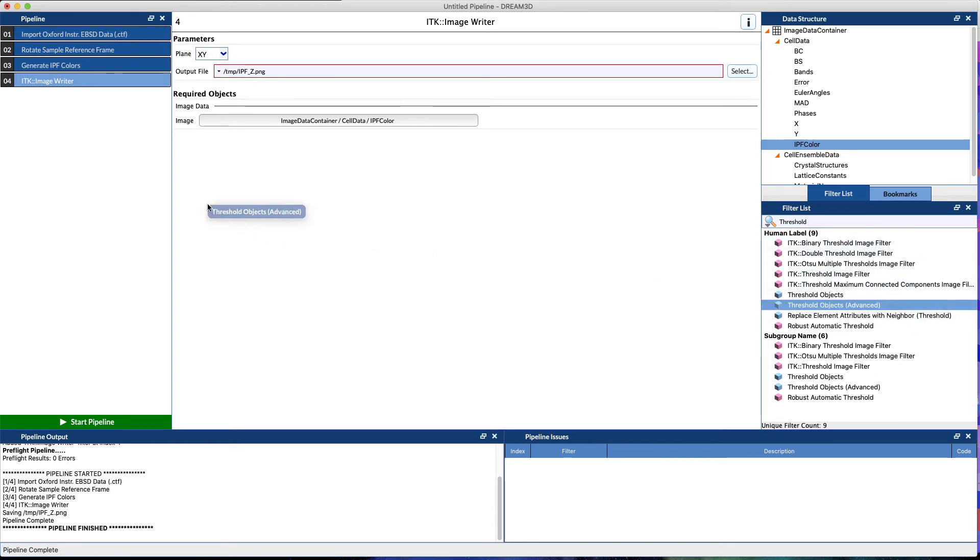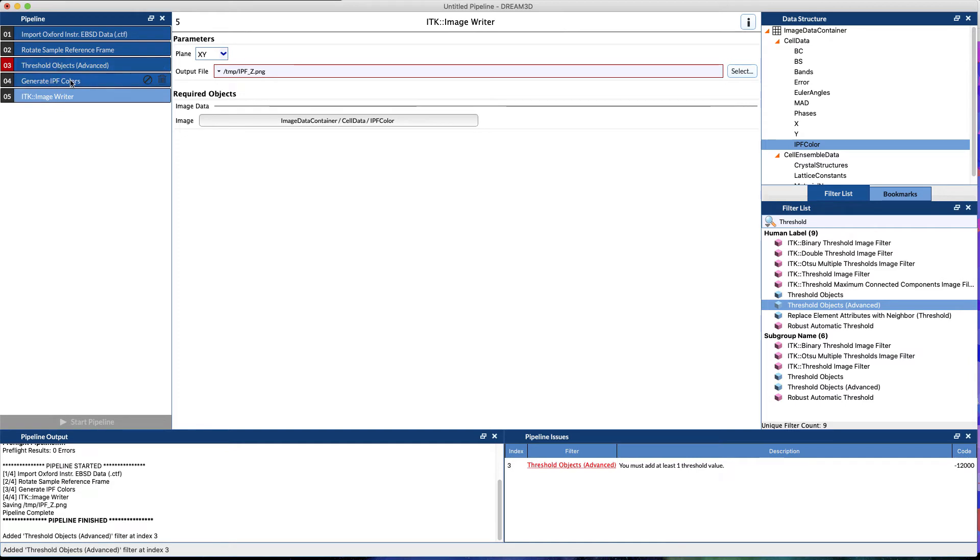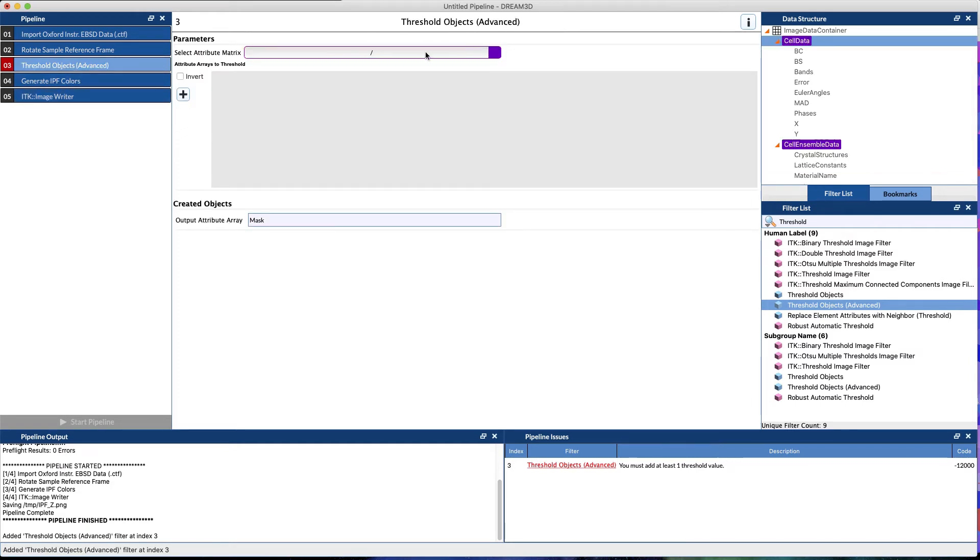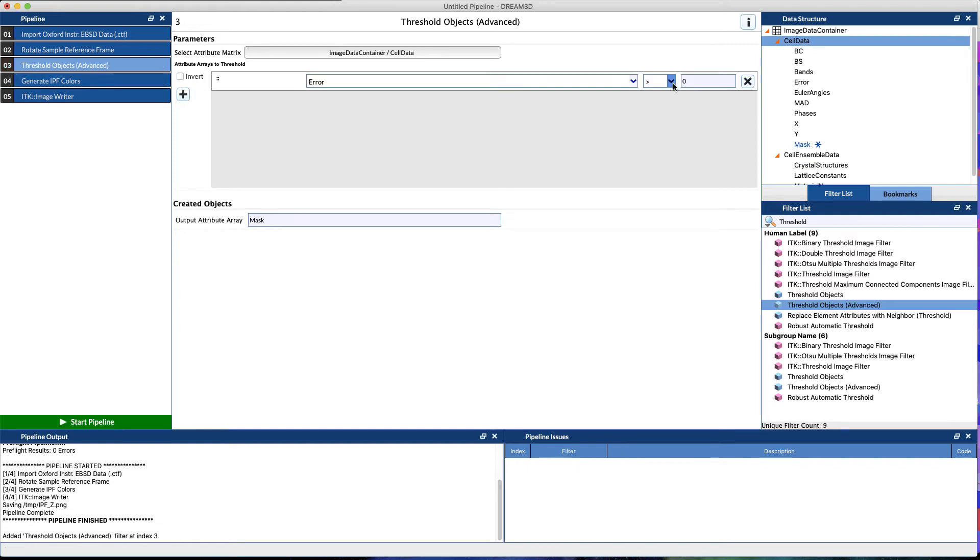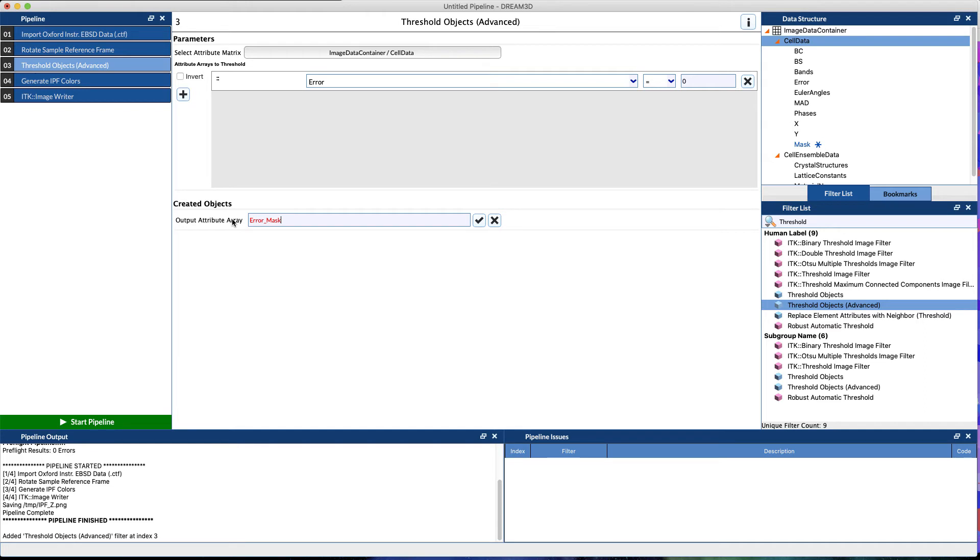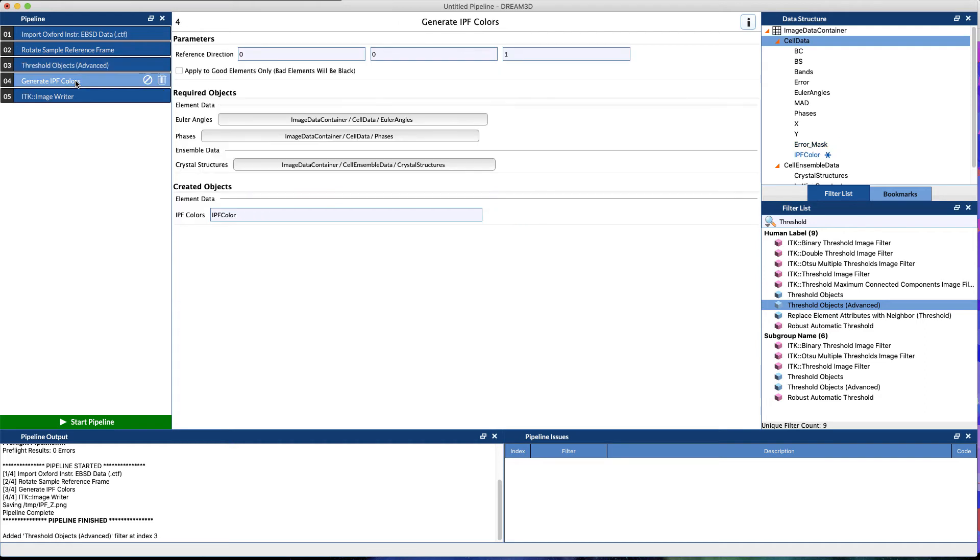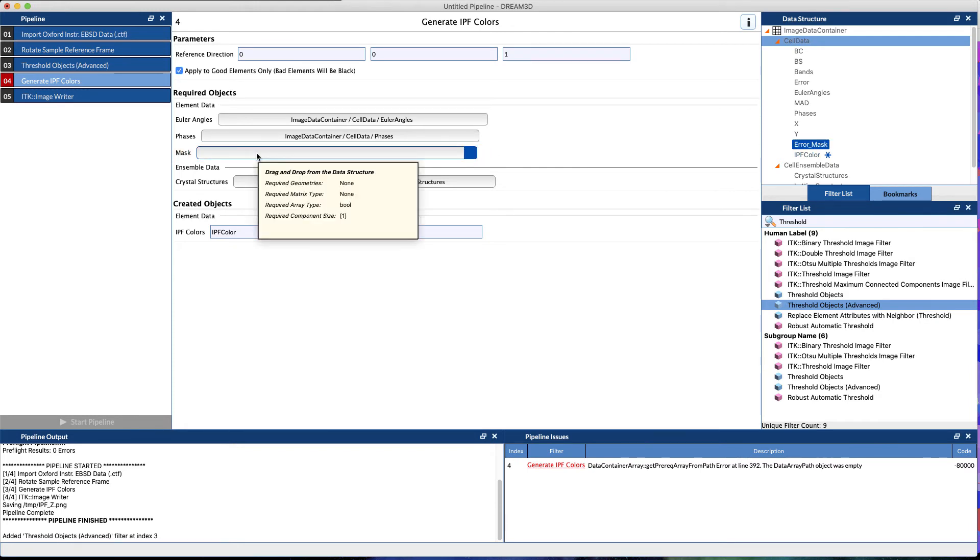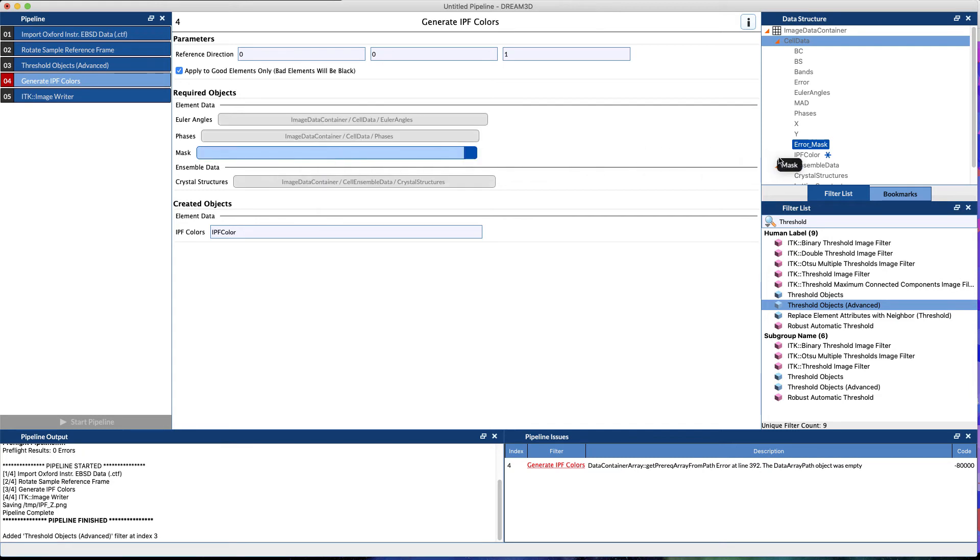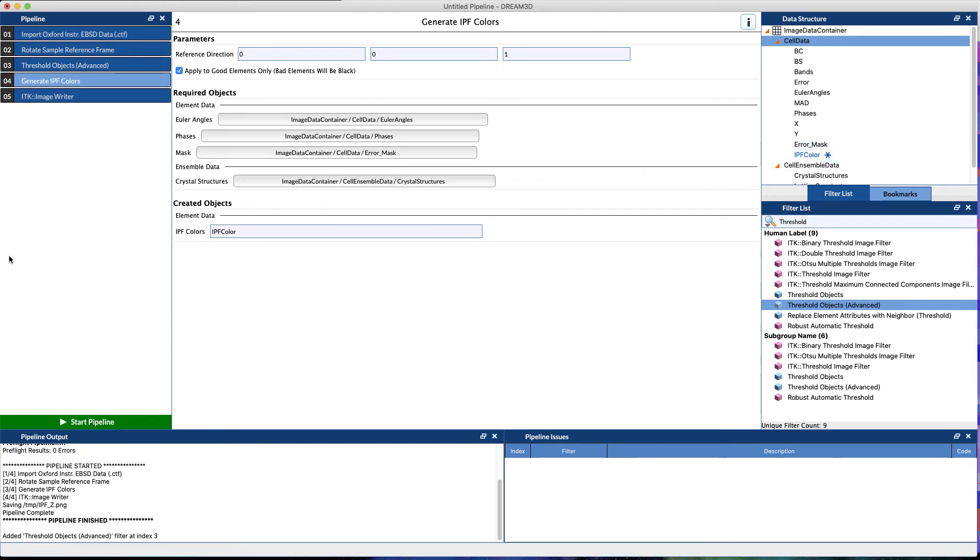We're going to say Threshold Objects Advanced. We want to put that in before generating the IPF colors. We want to threshold on the actual scan data itself, so we call that the cell data. If error equals zero, this is a good point, and that's what we're saying in this threshold: we want to mark all the voxels that pass a certain criteria, i.e., that voxel has a value of error equals zero and mark that as true. We can store this as the error mask. We simply call these thresholds a mask. You'll hear that referred to a lot when we do Dream3D. If you go back to the Generate IPF Colors now and you say apply to good elements only, now we have another data array that we need to populate, and we're going to put the error mask in there.